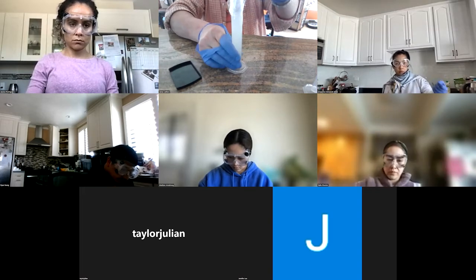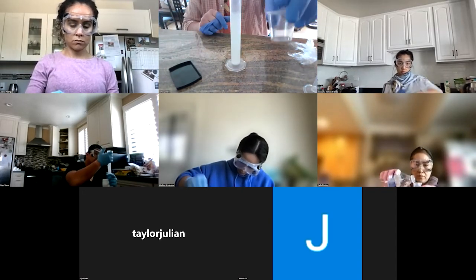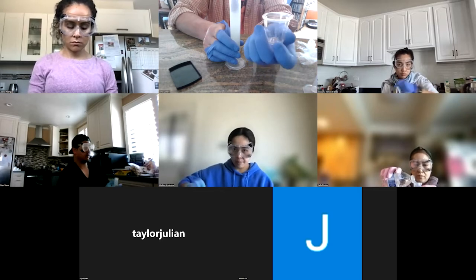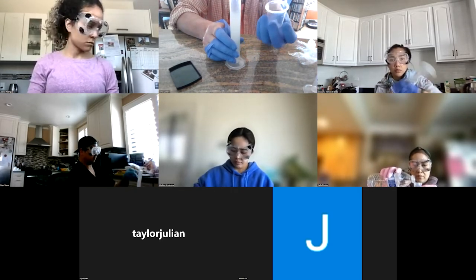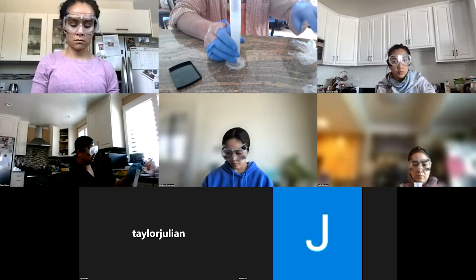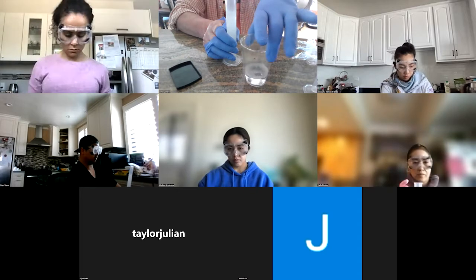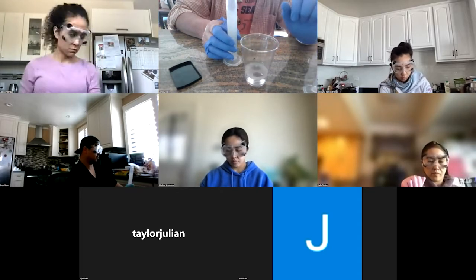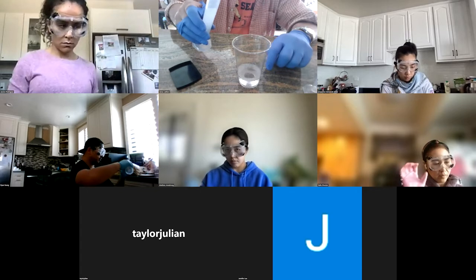All right. So you're going to want to take half of this and pour it into the medicine cup and put it away for a rainy day. I'm going to be using all 50 mils of my solution, so I'm just going to dump the whole 50.